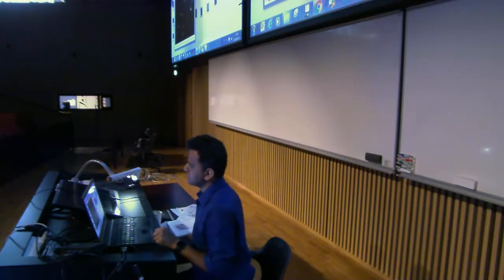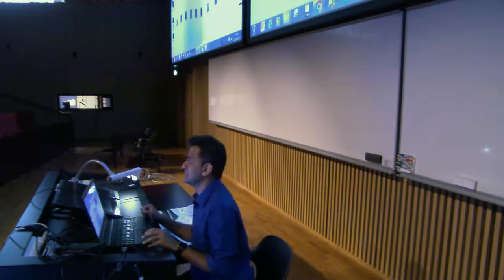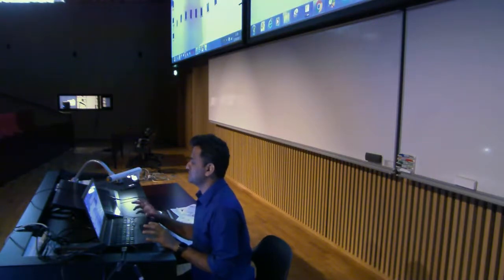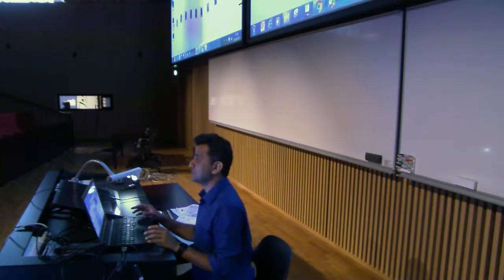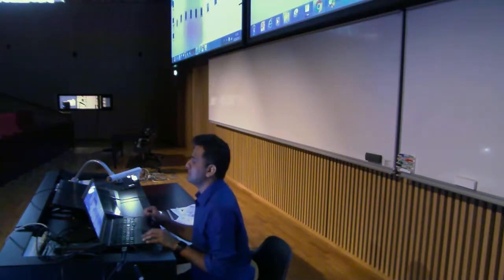There's also one slide that I wanted to show you, the comparison with the other software. Briefly speaking, Imaris is good for visualization. If you have 3D data and want to do cell tracking, I would still go for Imaris or Arivis or other software. If you want to do spot detection, go for IC, which also uses an ImageJ backbone.